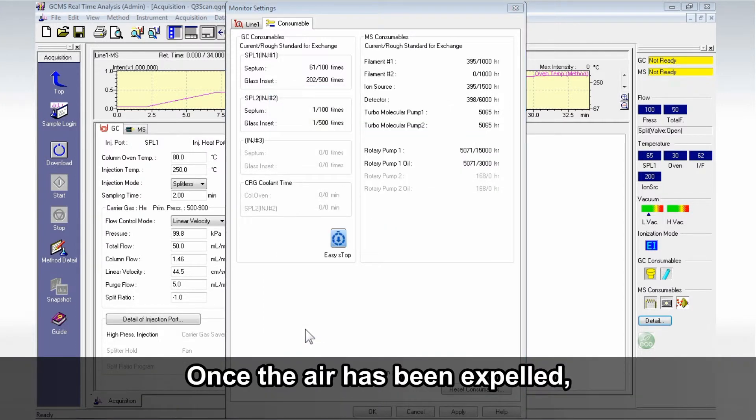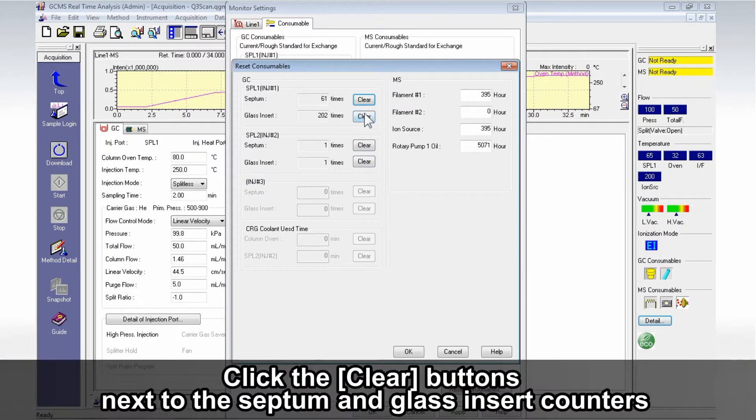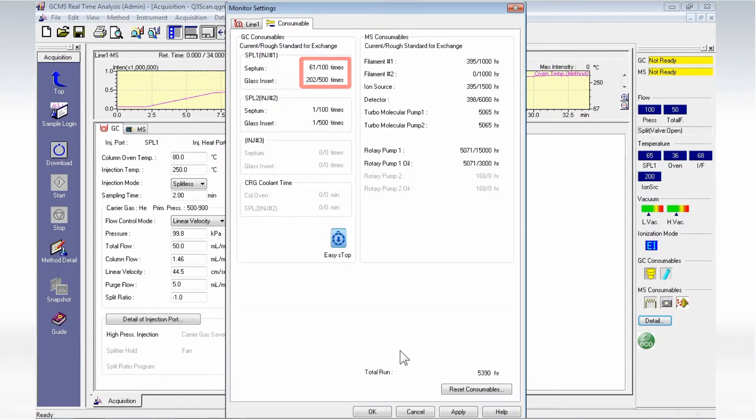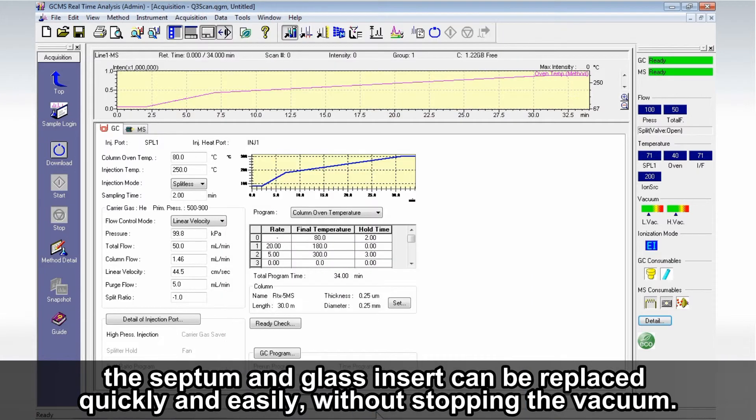Once the air has been expelled, the consumable's usage counter screen will be displayed automatically. Click the Clear buttons next to the septum and glass insert counters to reset their usage frequency to zero. By using the EasyStop function, the septum and glass insert can be replaced quickly and easily without stopping the vacuum.